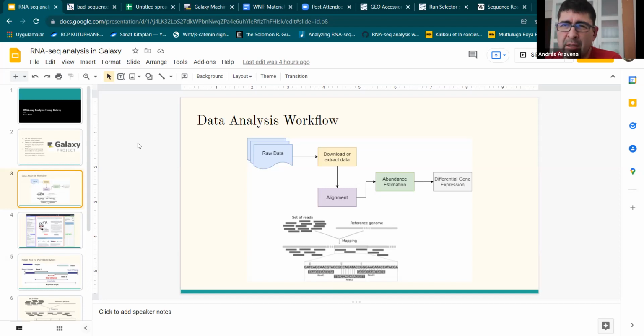I'm not 100% sure if they are sending that automatically, but they can. I mean, I had the same problem in my project. We were also trying to have patents because my project was industrial applications, so we were not hurting anybody. But there's a point that if you are using public services, your sequences, your private information is going to the cloud, and you don't know who is there.